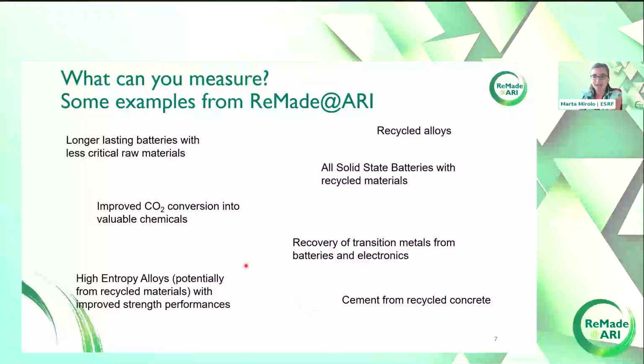How can we create alloys with recycled materials or with high entropy alloys, which again are easier to recycle? They are potentially coming from recycled sources and so on. So it's really diverse fields that are coming to use X-ray diffraction.